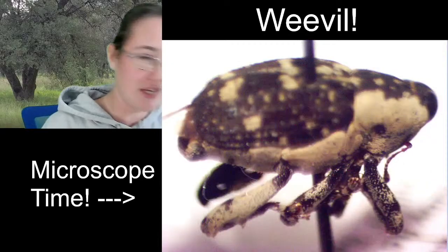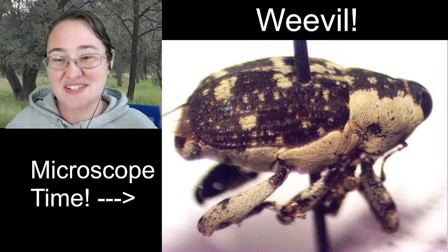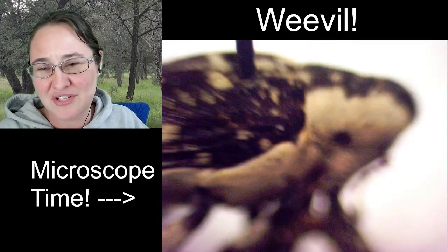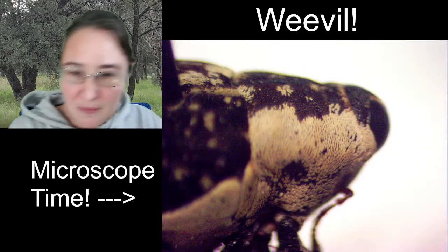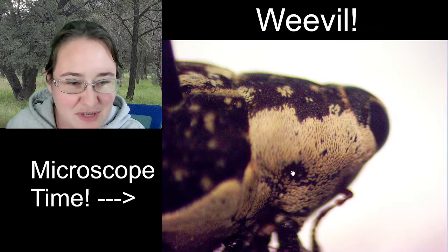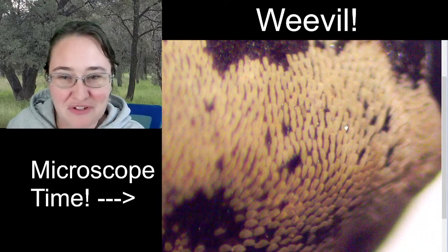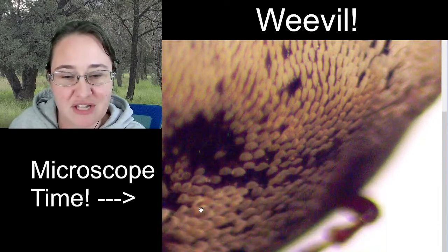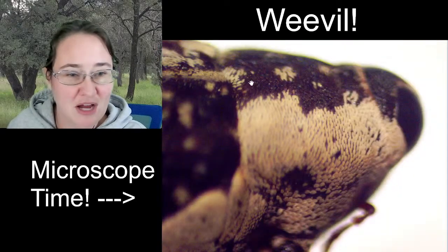So this one is cool because of the scales all over its body, or I believe they're actually hairs in the shape of scales. All of this white is actually scales that cover its exoskeleton. Let me see, I might even be able to zoom in further. You can check out all of those really nifty scales on its body, and that's where the white color comes from. In regions like down here where there are darker spots, it's just where the scales have been wiped off.